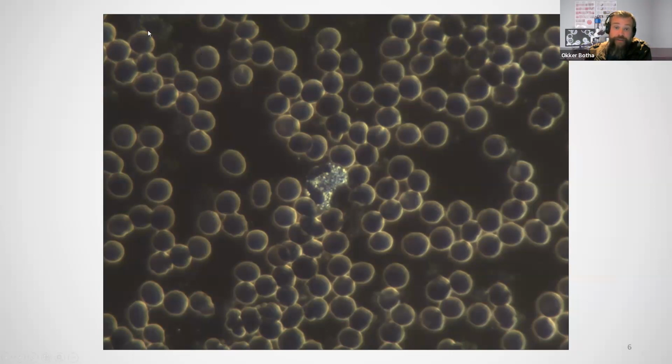It's quite interesting in this image, in the upper left-hand side here, we can see some faint patterns in the background there, almost as if there is something there. These may actually be platelets, thrombocytes, and often we see interesting things happening around thrombocytes as well, which, in this case, unfortunately, we can't.